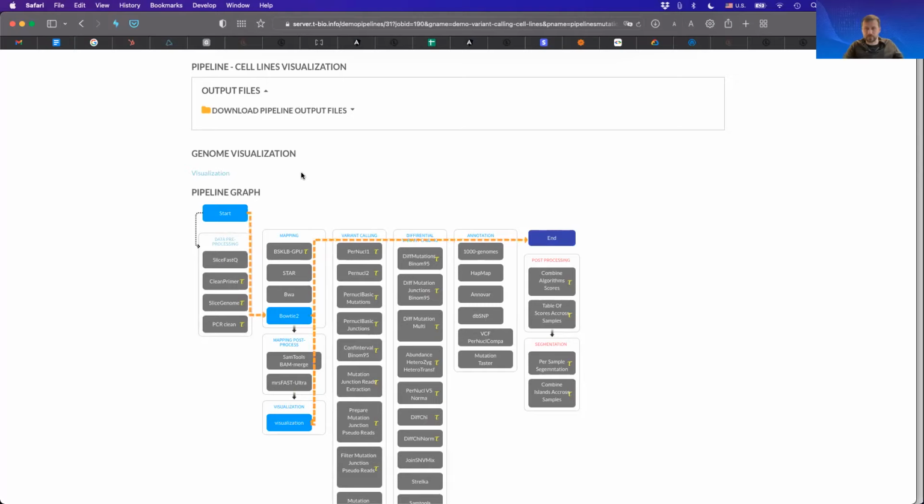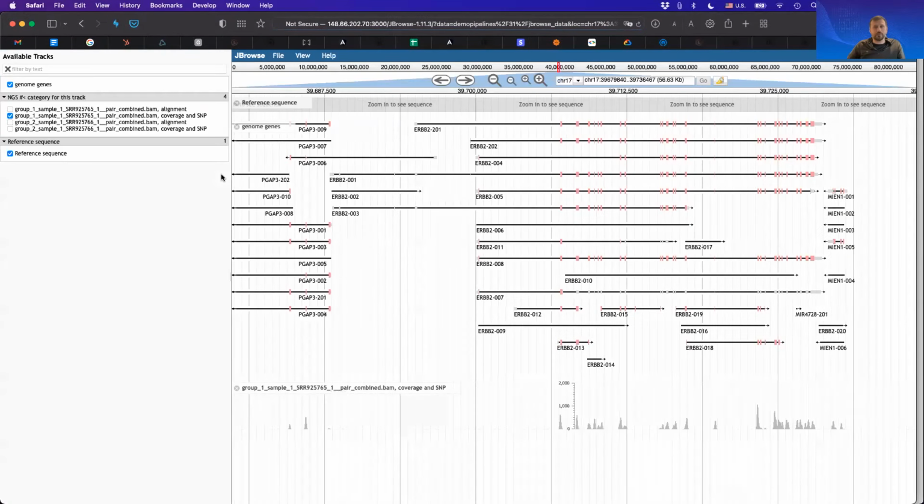All right, perfect. So Raphael got it. Did anyone else? All right, excellent. So let's click on visualization and let's see what comes up.